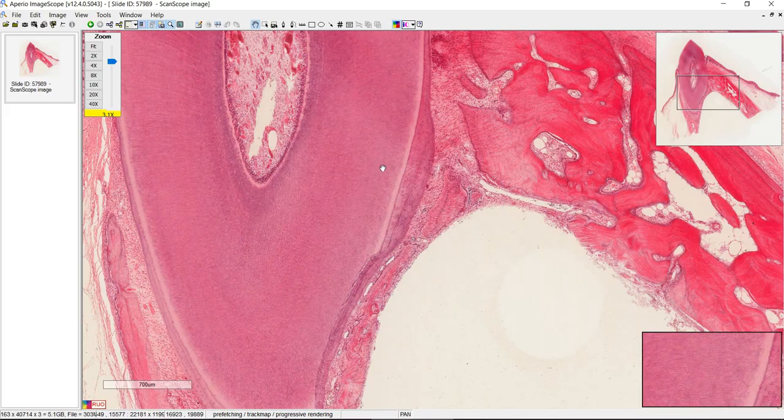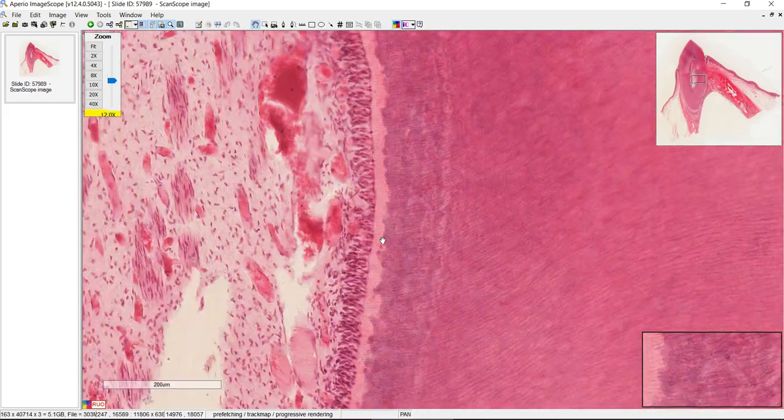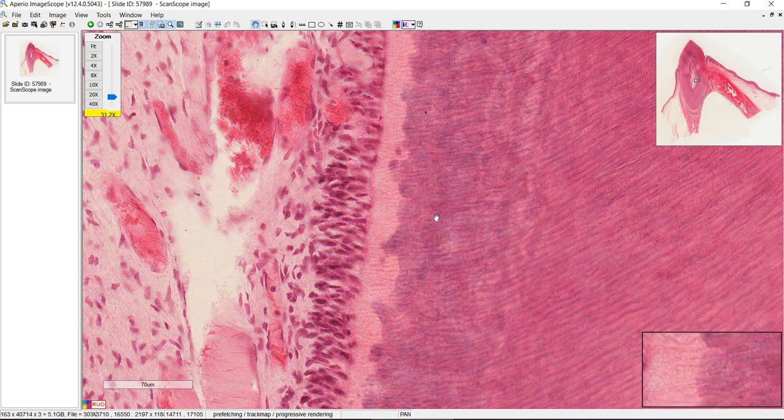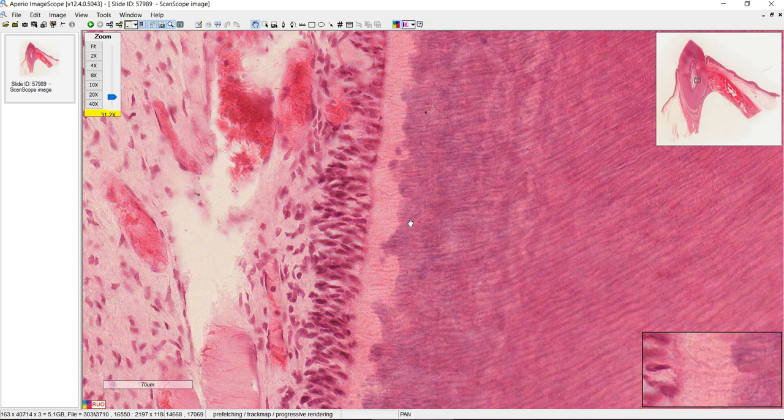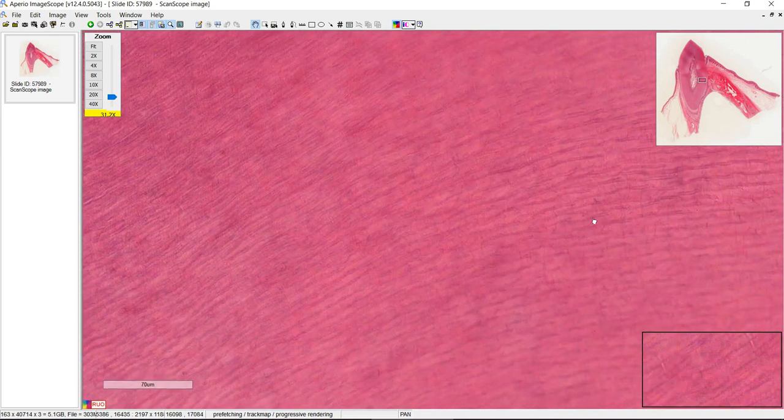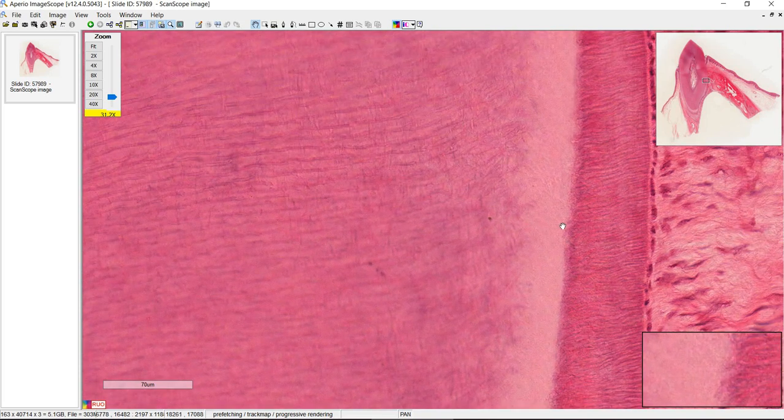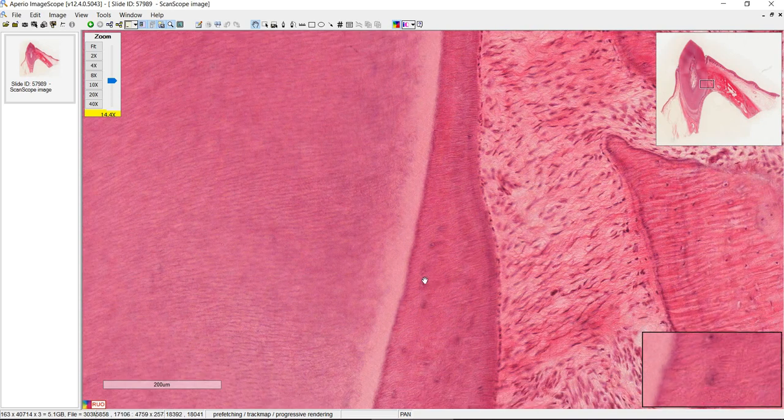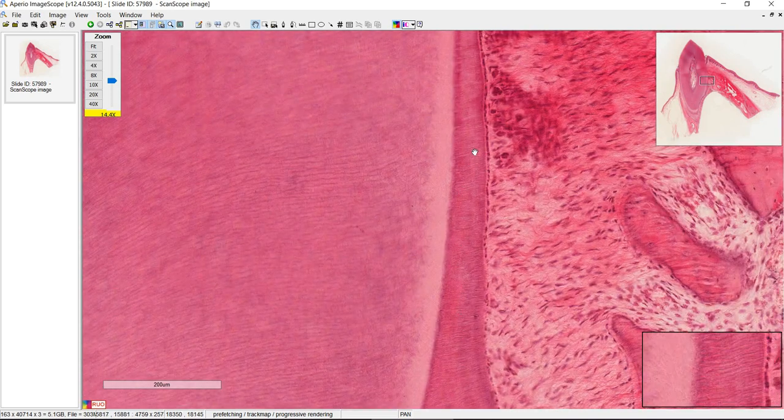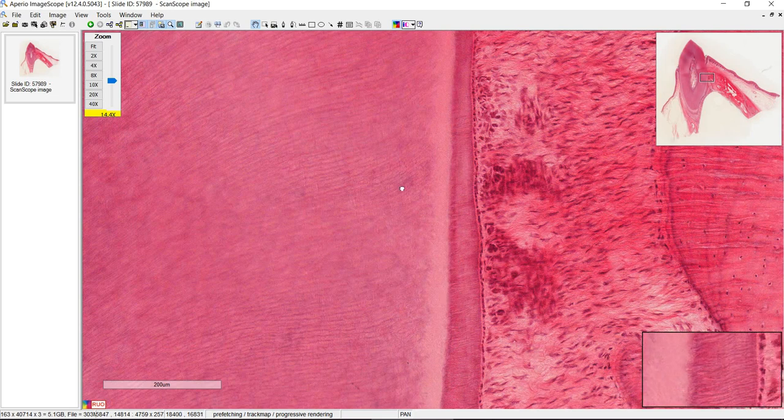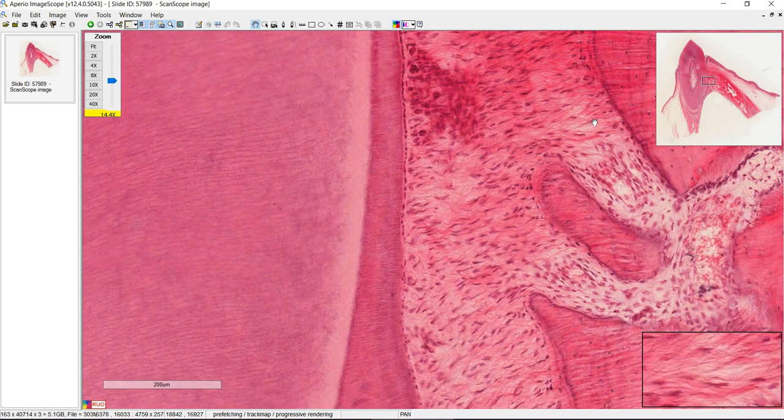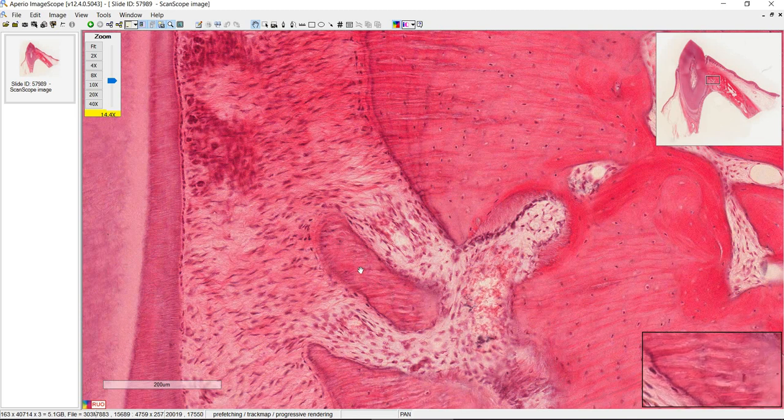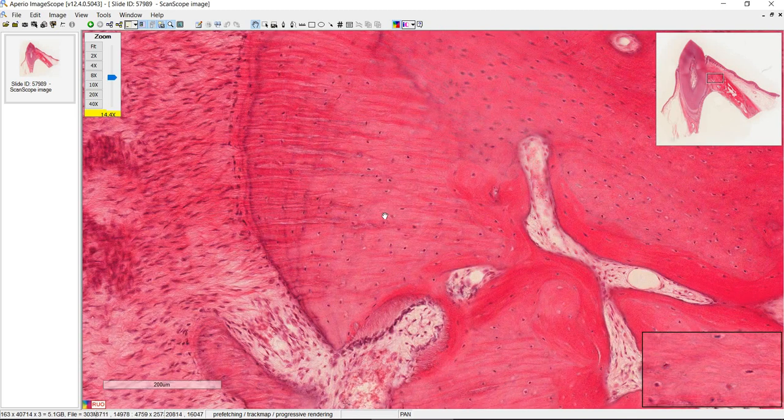So just a review going on the other side. Odontoblasts with their Tomes fibers. This is pre-dentin. All of this is dentin. This is still dentin. This is cementum with the cementocytes and again it's getting really thin as you go further up. Here's the periodontal ligament. And we have alveolar bone here, alveolar bone here.